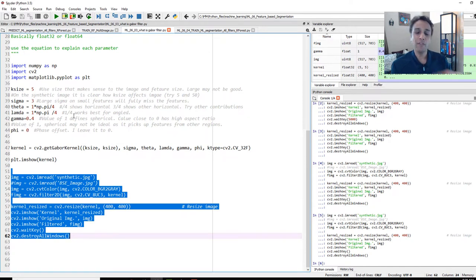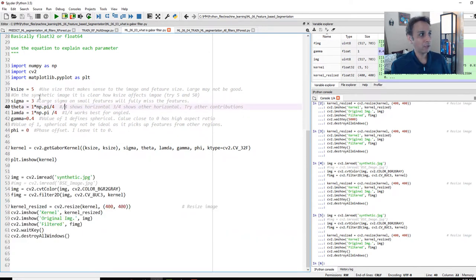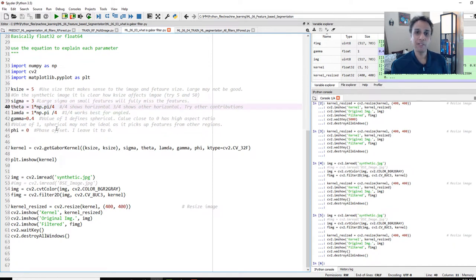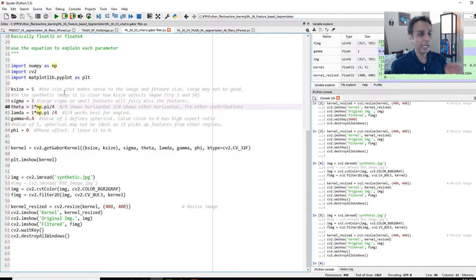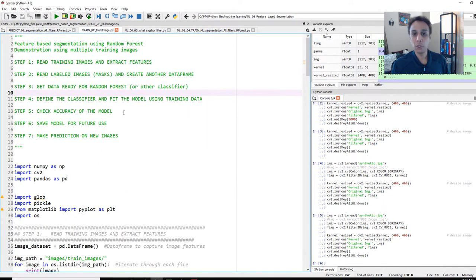You have to create a bank of filters, meaning you have to change the sigma multiple times, theta, lambda, gamma, all of these, and then generate a whole bunch. With that information, let's actually jump into the actual code for today's video.